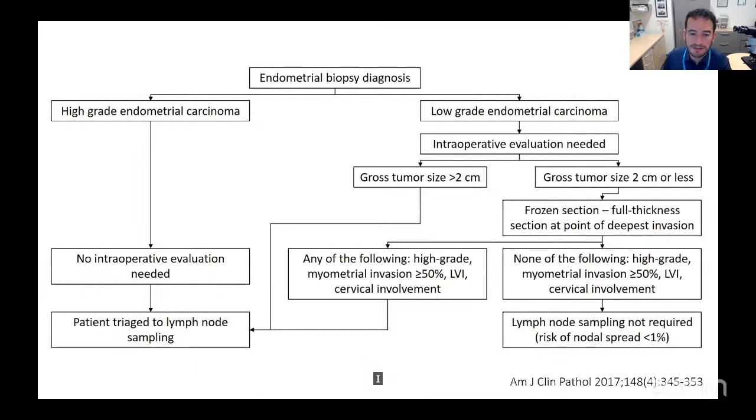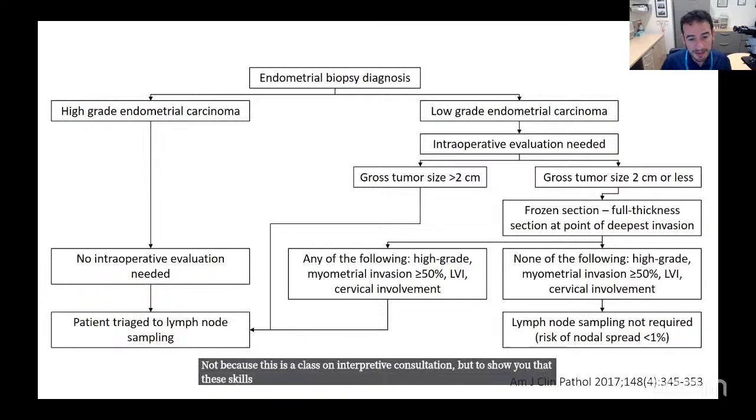I'm showing you this not because this is a class on intraoperative consultation, but to show you that these skills on approaching the uterus macroscopically can also help you in the frozen section room if you fall into one of these situations.